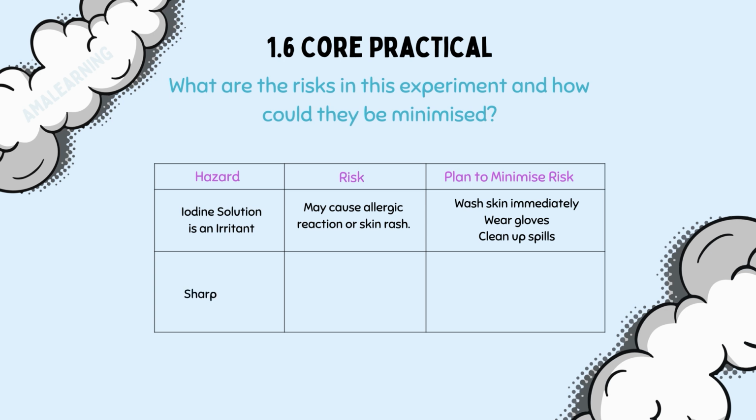Sharp knives are hazardous because they can cause cuts. When using a knife, cut away from the body, cut on a chopping board and make sure the blade is covered when not in use.